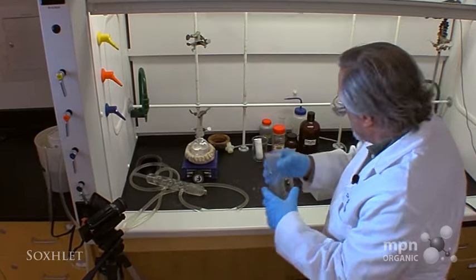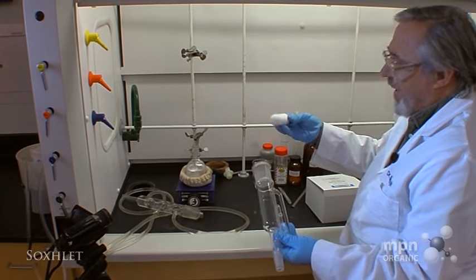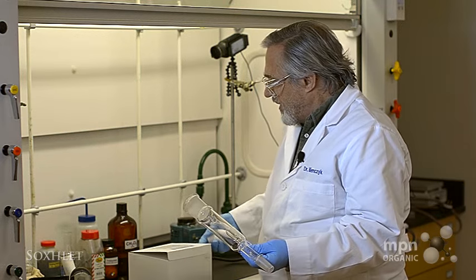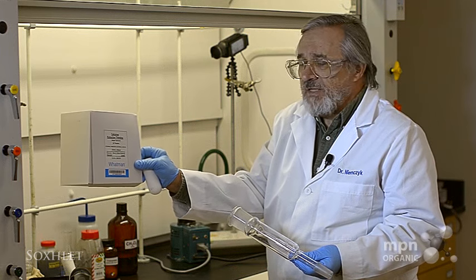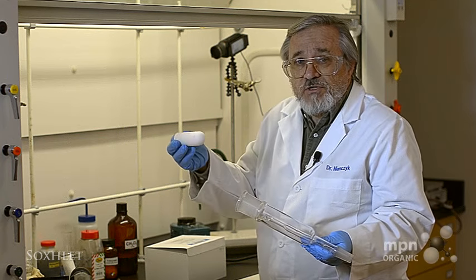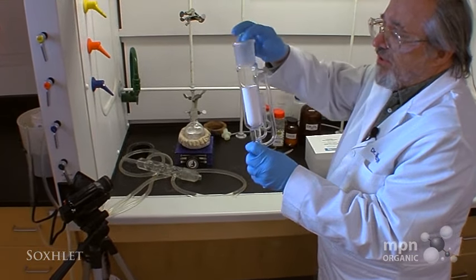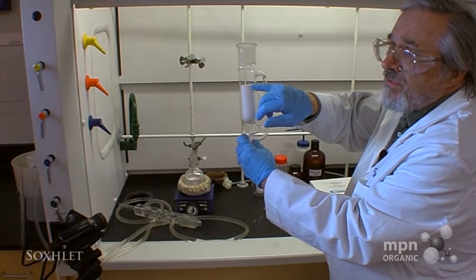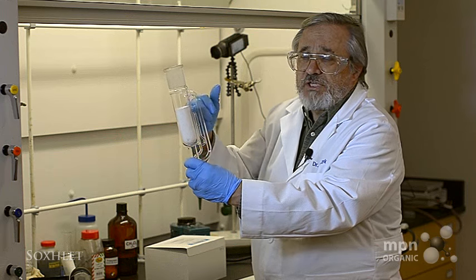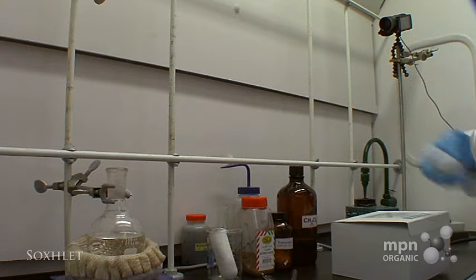The Soxhlet extractor operates on the basis of continual extraction, which we'll demonstrate. We're going to put the nutmeg in one of these thimbles. These thimbles are made of cellulose — that's the same stuff that they make filter paper out of. So this is a piece of filter paper simply molded to fit the well in the Soxhlet extractor, and it's slightly higher dimension than this little tube that goes here.